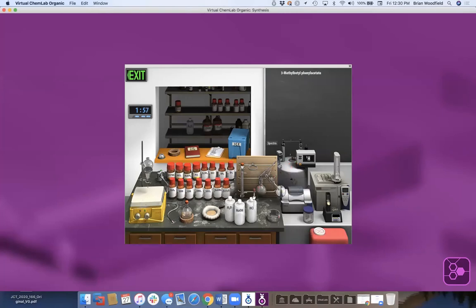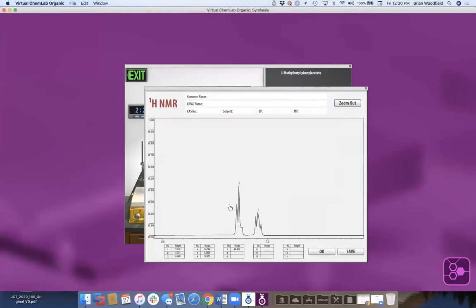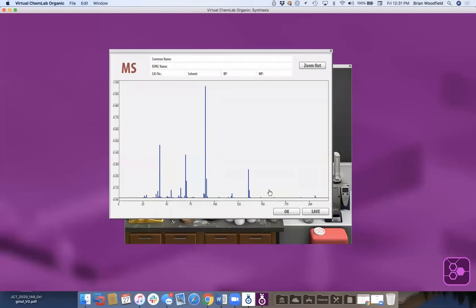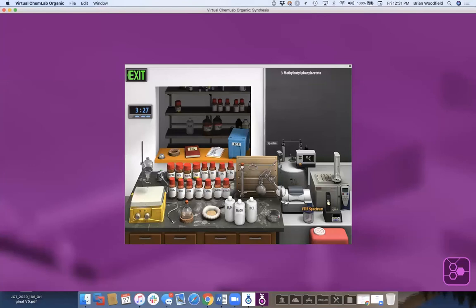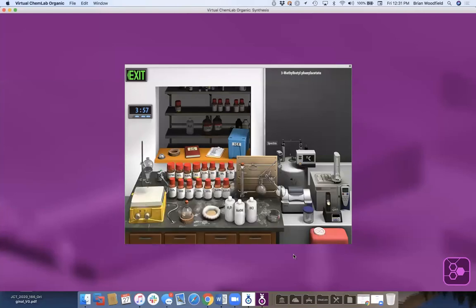I grab my NMR tube for proton NMR and show a real spectrum of what's there. Numbers indicate peaks and below are the integrations — students have to integrate how many protons are associated with each peak. They can save that to their lab book. For an advanced lab, you can also do carbon-13 NMR, mass spec — all real spectra acquired from Sigma — and FTIR. Students need to identify peaks and use the spectra to prove what they made.